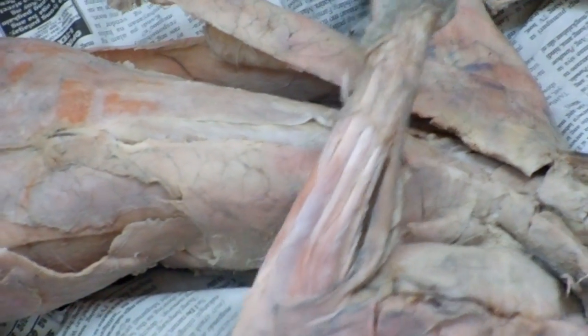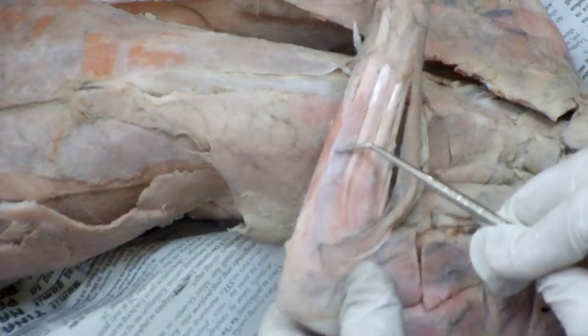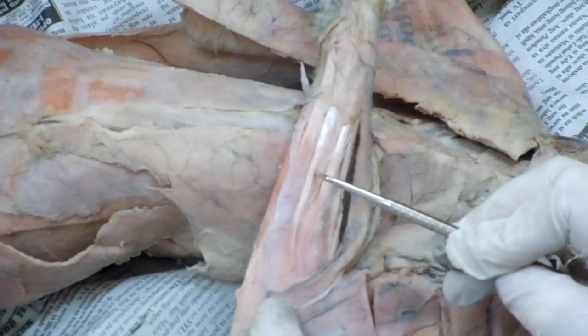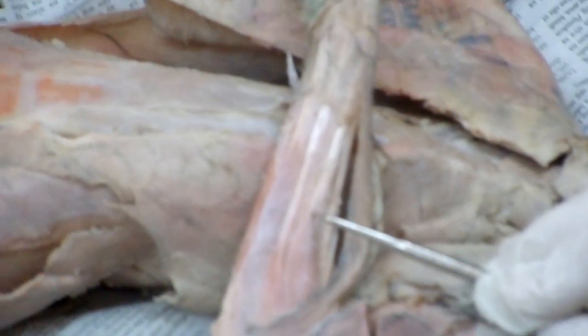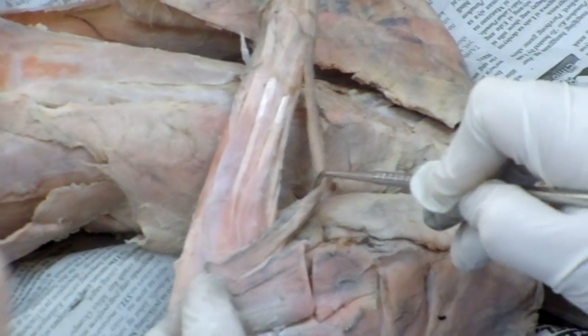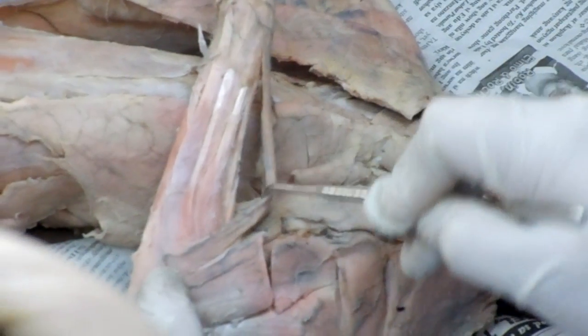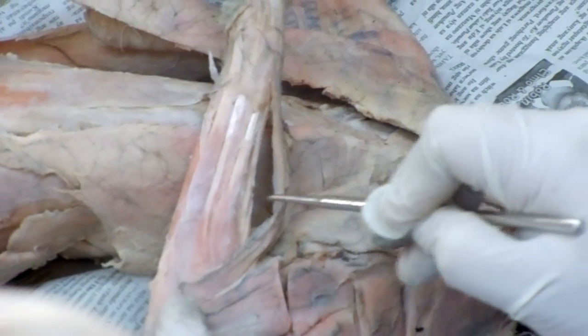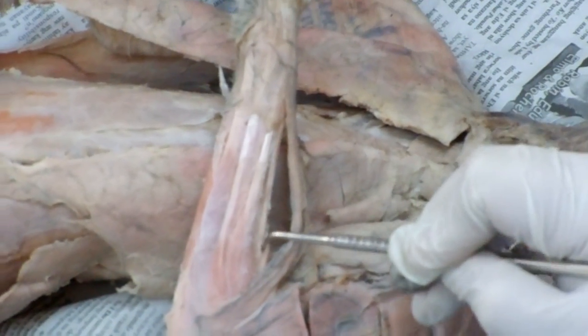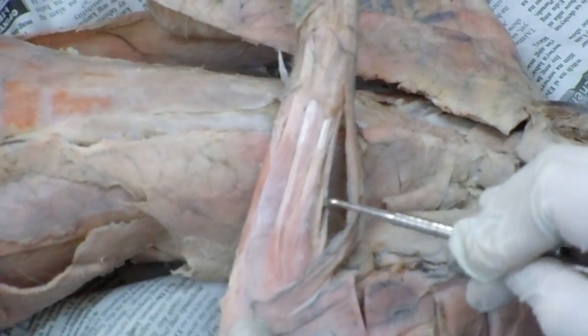Review. Extensor carpi ulnaris. Extensor digitorum lateralis. Extensor digitorum communis. Brachioradialis, supinator longus. And this one now is extensor carpi radialis, divided into brevis and longus.